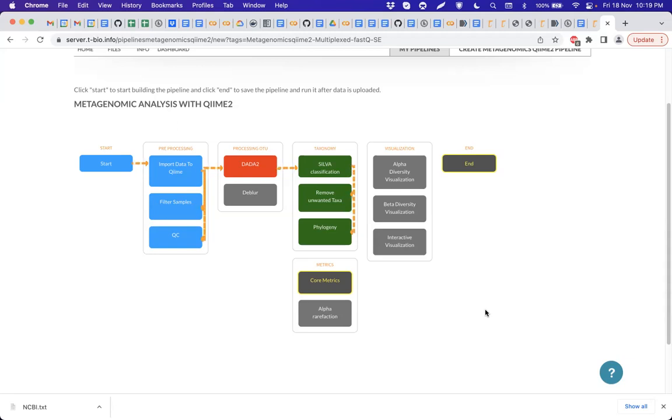Because amplicon sequencing is very cheap, and people go for enormous depth in amplicon sequencing, and then you don't get a lot of bad quality reads at all, and you have enough reads where these bad quality reads will be eliminated, or that position will be eliminated as technical noise, right?